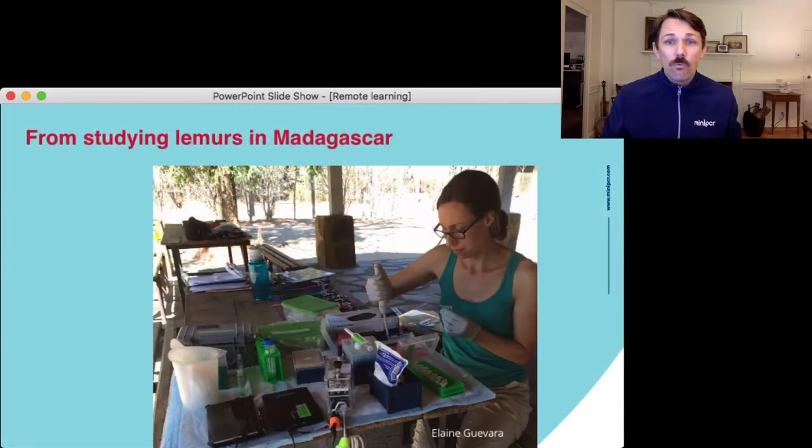So, for example, Dr. Elaine Guevara brought her equipment to Madagascar to study lemurs in a field station where there's no electricity. Because our equipment is small and low power, she was able to run it off batteries and charge those batteries using solar panels.